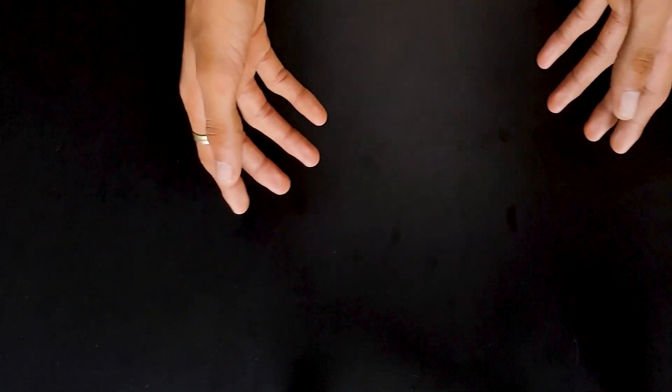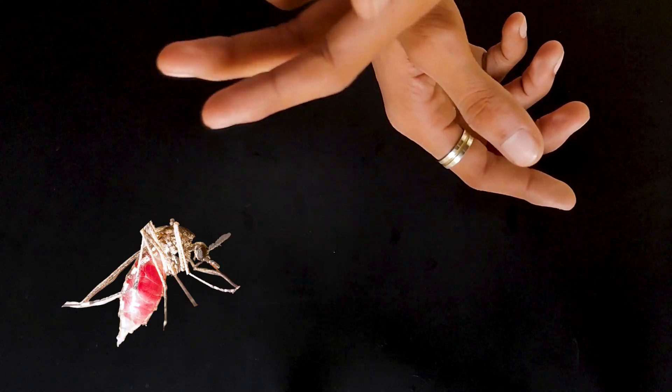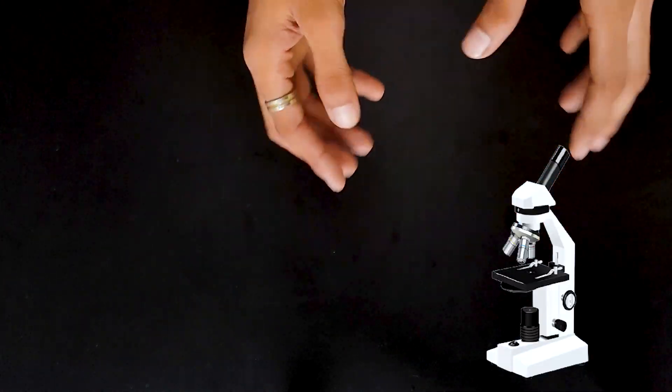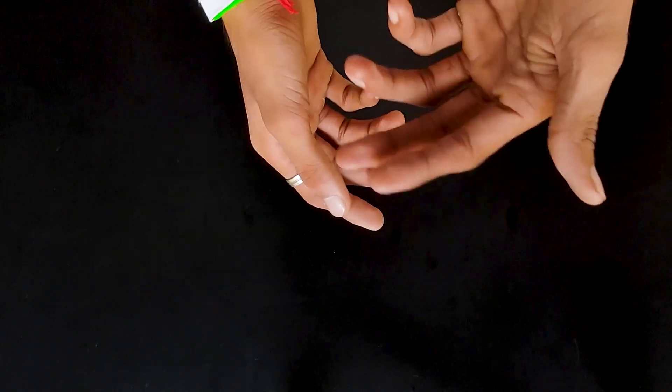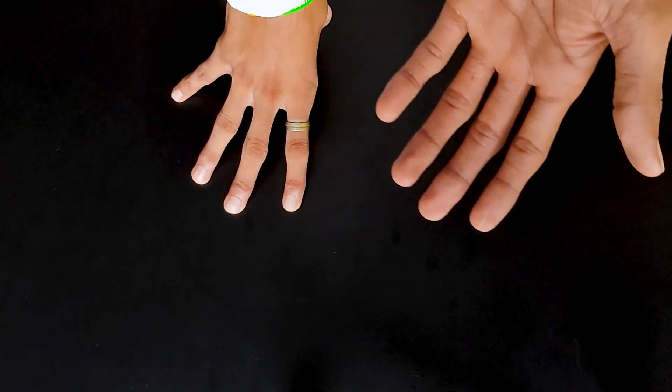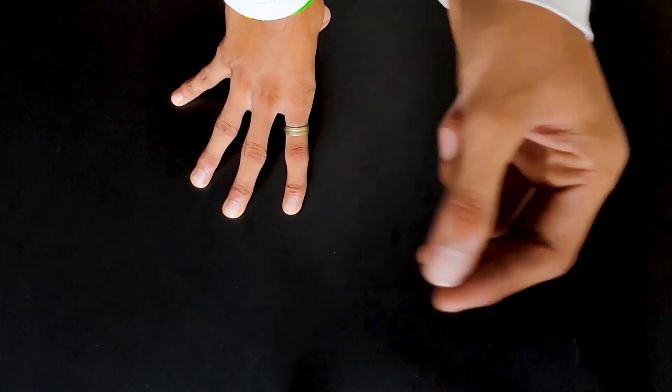This video is going to be about a mosquito under a microscope. Some of you may already know about it because I have already shown some part of that in a previous video of mine.